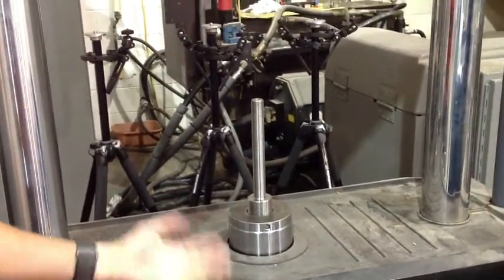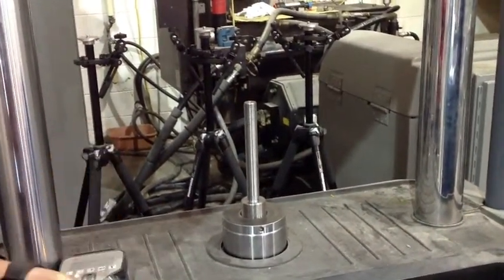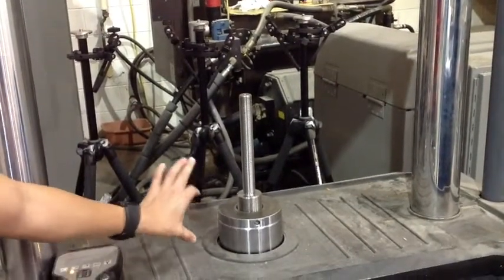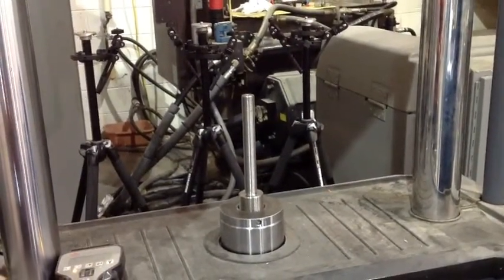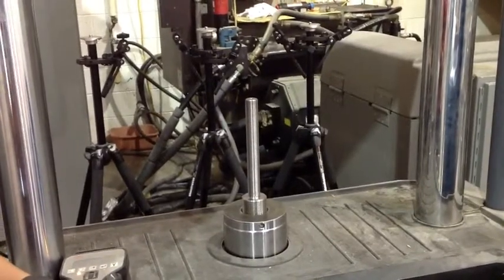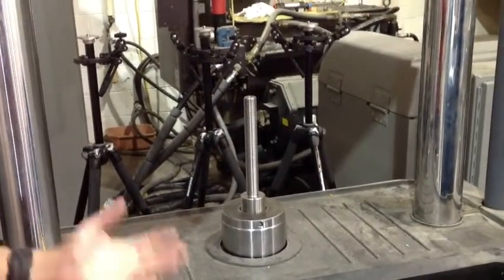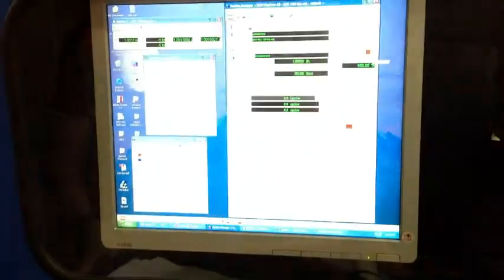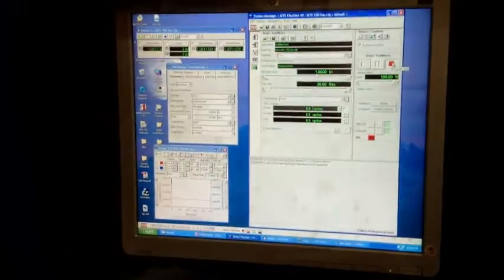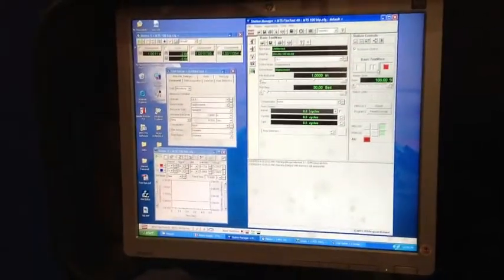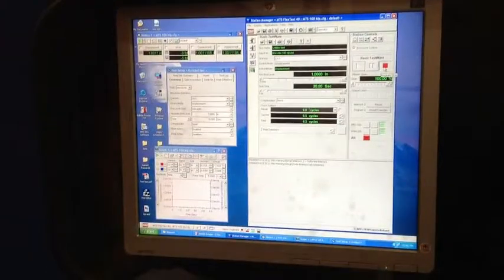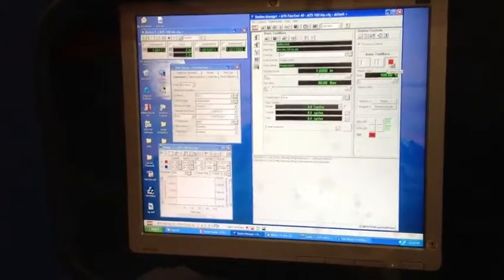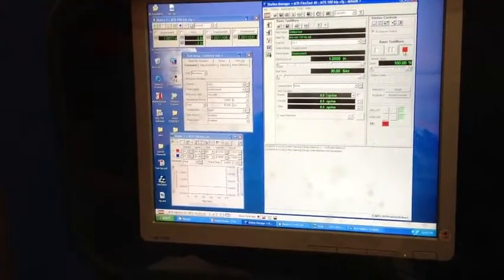See, the actuator is rising very slowly, but you can see it keeps rising. It's pretty much done. So after 30 seconds, you can see the test is done because the program stop button starts to turn red. And that is what we need to do in a monotonic compressional test.